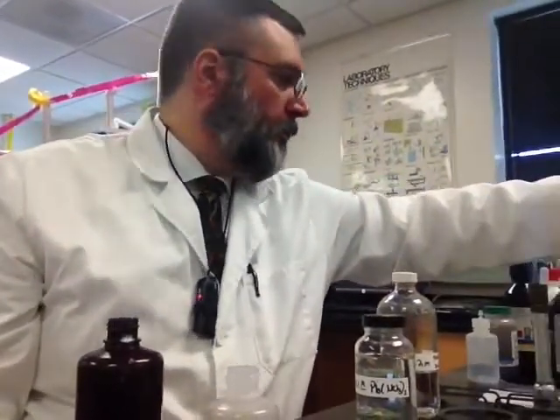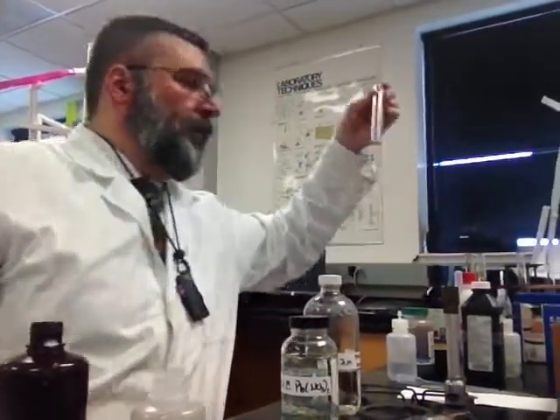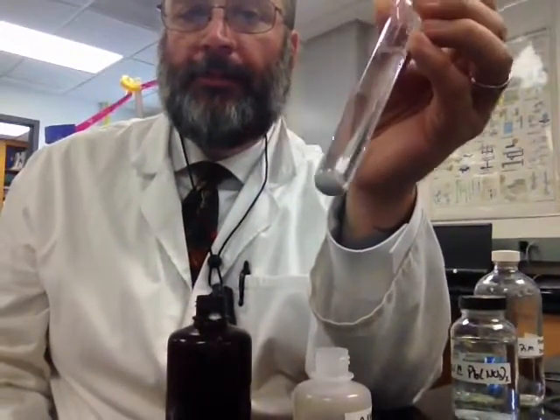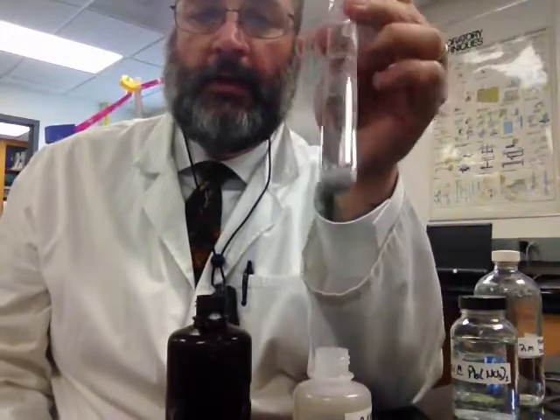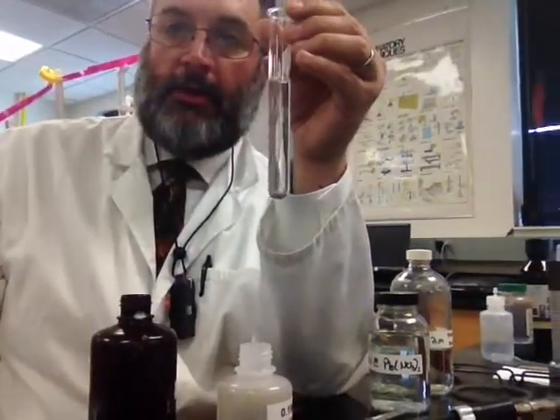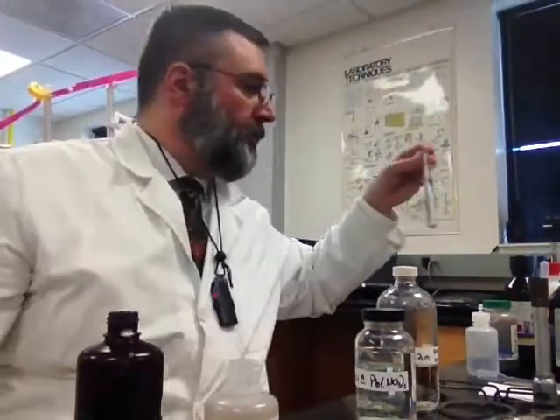That will also settle out. And eventually it'll look like this. Okay, all of that down the bottom. That's your precipitate. And then the solution above it is also clear and colorless.